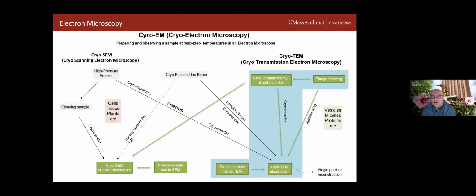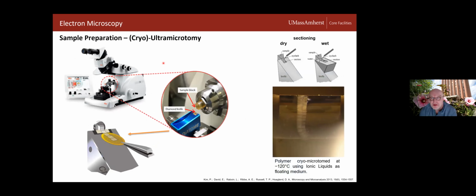So you might think, what has all of that to do with particles floating on a liquid and observing that in an SEM, right? Because this one is all frozen. But we do a lot of ultramicrotomy, as you might have realized, and this is what an ultramicrotome looks like. You put your sample in here, typically in epoxy. If you have a polymer material, that's more convenient since it's already a polymer. You don't really have to embed it most of the time, and then you cut it.